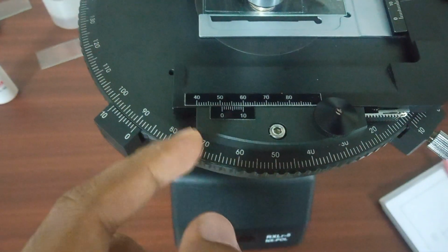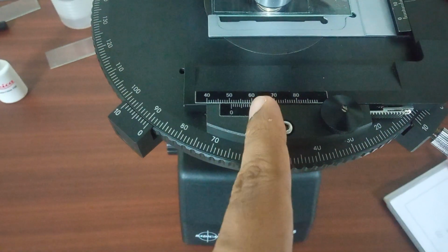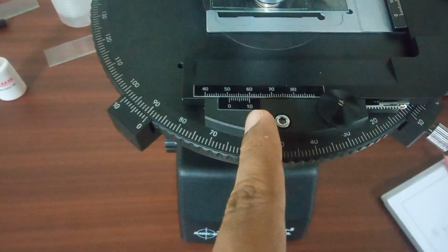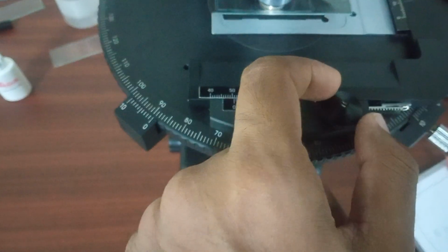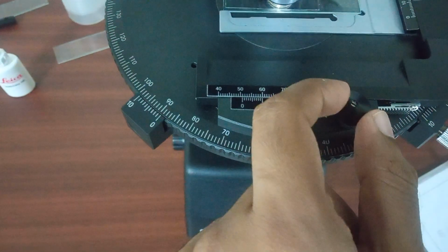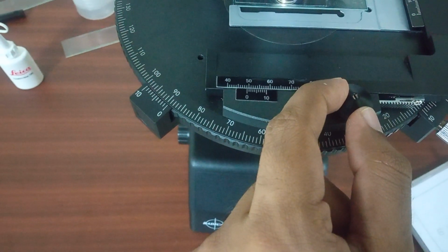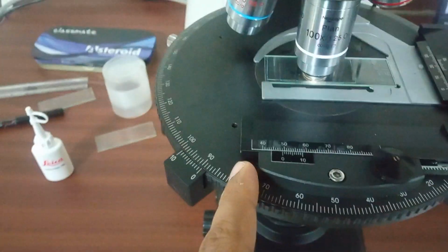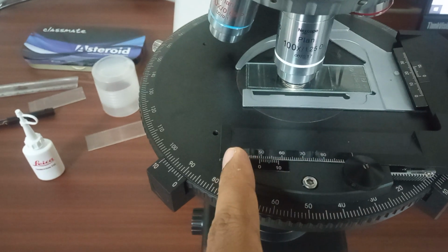Hello, if you look carefully here, 60 and 10, the lines are touching each other and form a straight line here. And if you move the knob here clockwise, then you can see it's progressing towards this side. That means the slide you have is progressing towards this side.